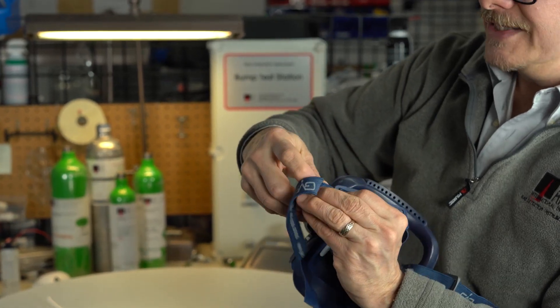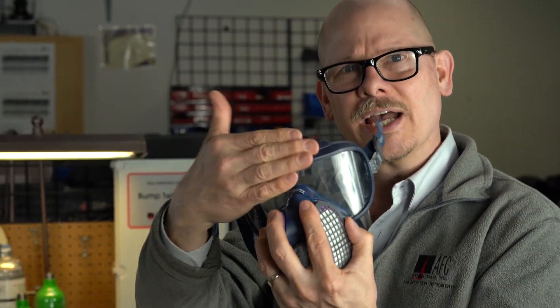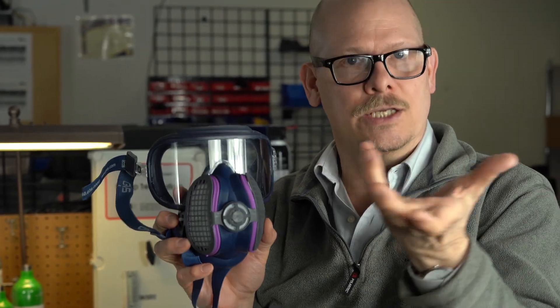Now the reason we're doing this video — we've had a lot of questions like, what is this Integra compared to the Ellipse other half face mask? Well, the Ellipse is basically this portion down here without these goggles and safety glasses. It's the same mask, uses the same filters. It's just that the Integra incorporates or integrates the face shield and eye protection.